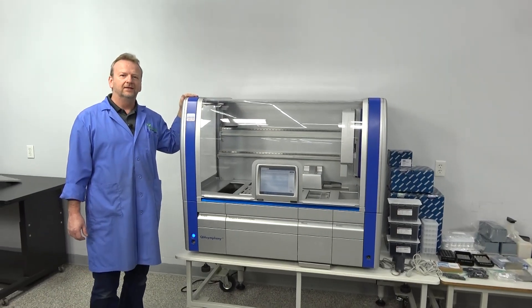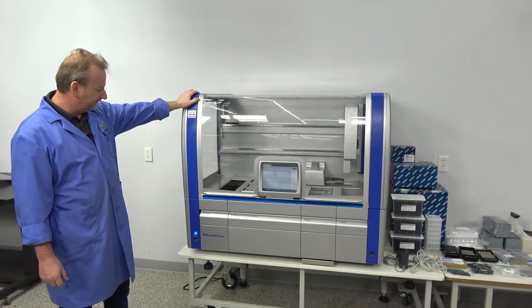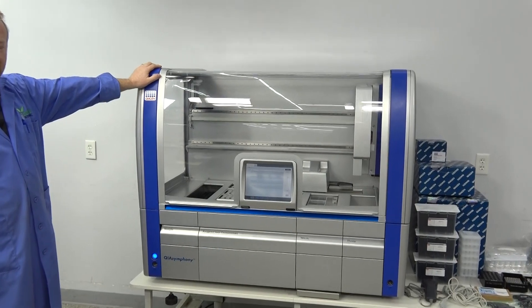Hi, I'm Rich here at New Life Scientific, and today we're showing off our QIAGEN QIAsymphony SP. It just came out of the tech shop and it passes with flying colors.